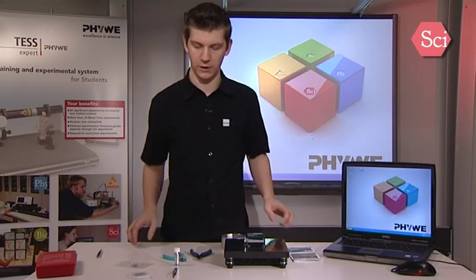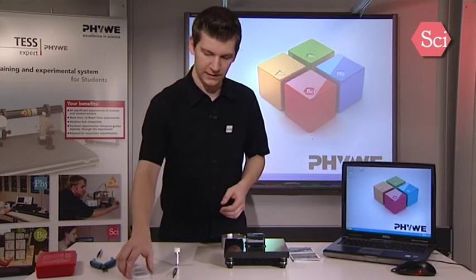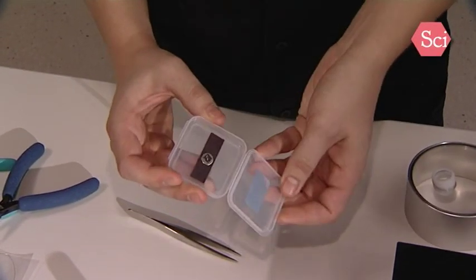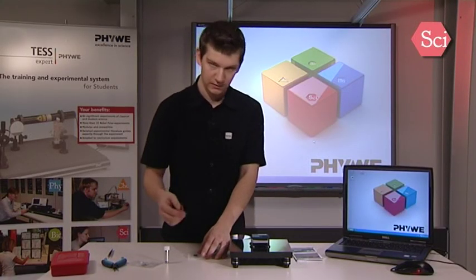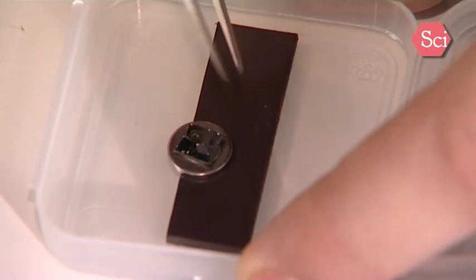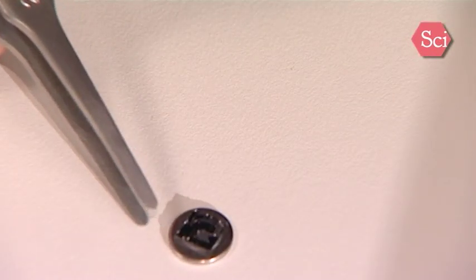We will now start by preparing the sample. We have here a graphite sample which has a layered structure, so it is easy to peel off the upper layer of the graphite. Now take the flat tweezer, get the sample out of its box, and place it on the table. Now we use some adhesive tape to peel off the upper layer of the graphite sample.